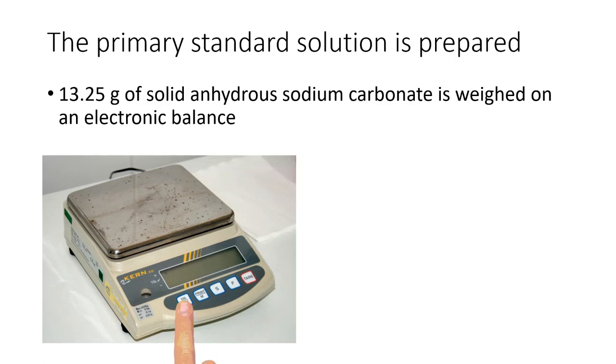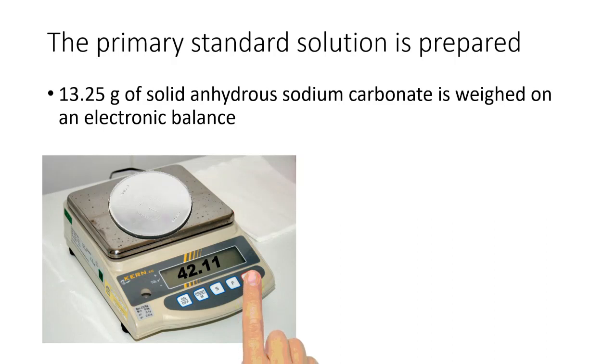So I'll switch the electronic balance on, and then I'll place the container upon which I'll put the solid anhydrous sodium carbonate. Now that container, that dish, weighs 42.11 grams. But what I do is I press the tare button, T-A-R-E, and I set that mass to 0.